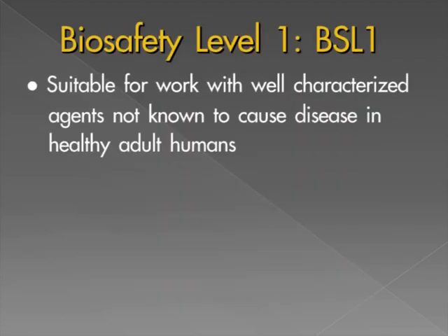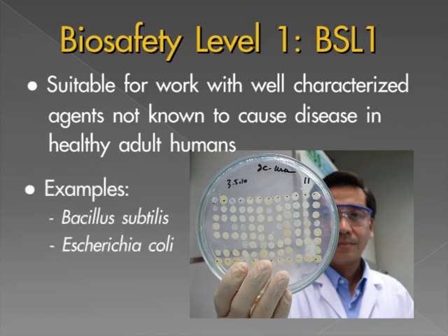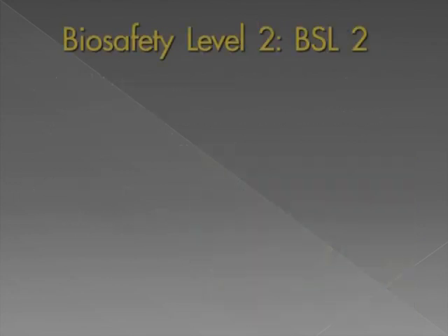The practices, safety equipment, and facility design and construction of a biosafety level 1 or BSL-1 facility are appropriate for laboratories in which work is performed using defined and well-characterized strains of viable microorganisms that are not known to consistently cause disease in healthy adult humans. For example, Bacillus subtilis and Escherichia coli.